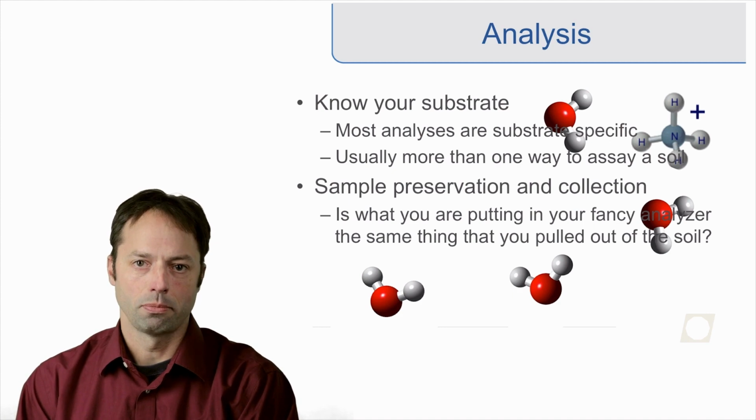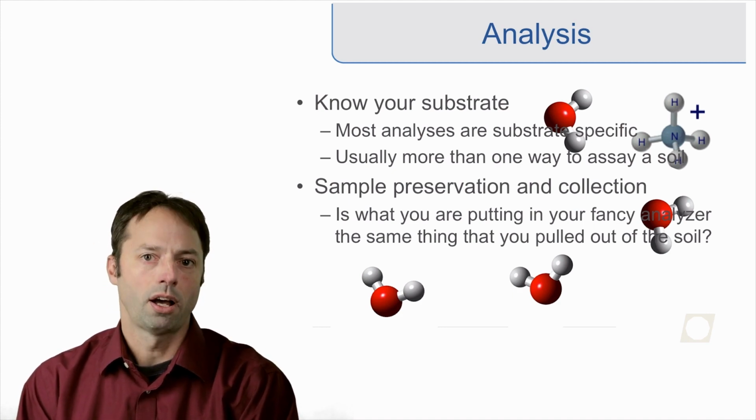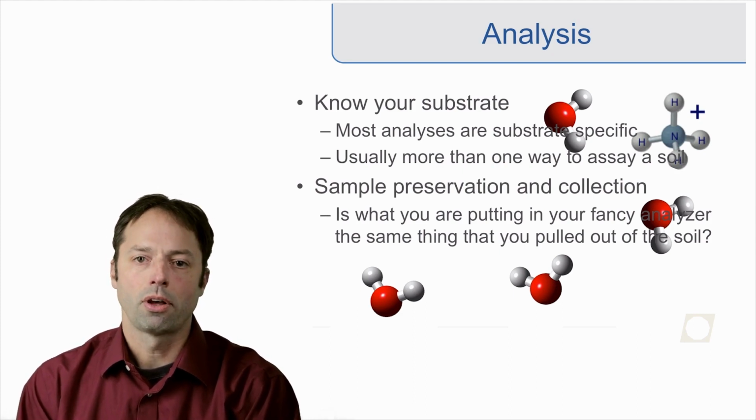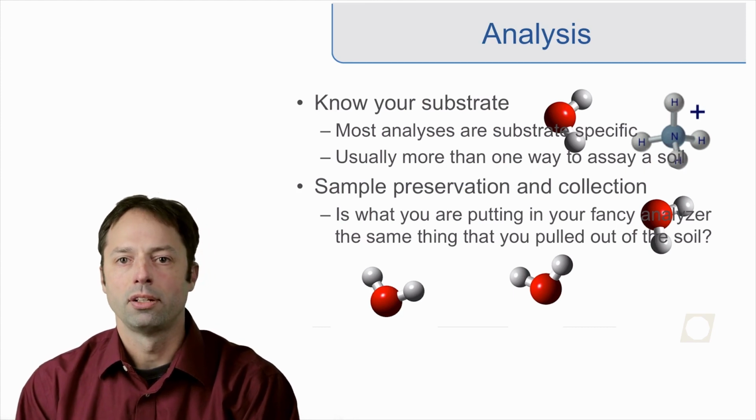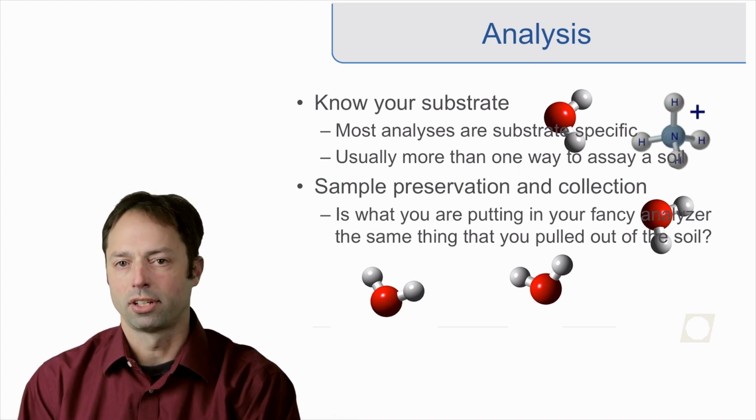There are some considerations that need to be made regarding sample preservation and collection. I'll go over a few of those. And you also need to think about the difference between what you're putting in or what you're pulling out of the soil and what you're putting into your analyzer. So we'll talk about some things to consider there as well.